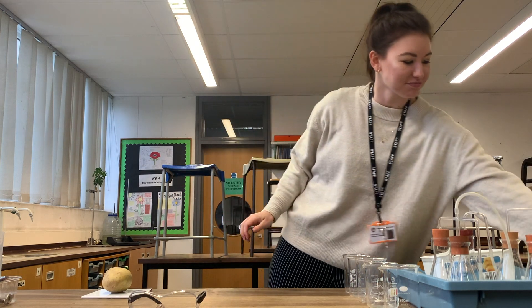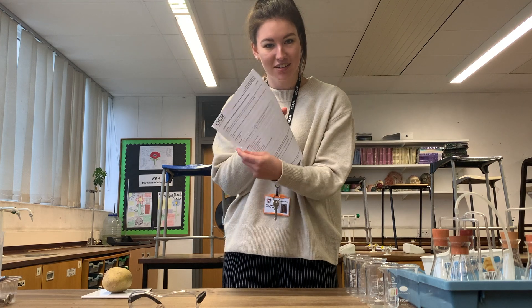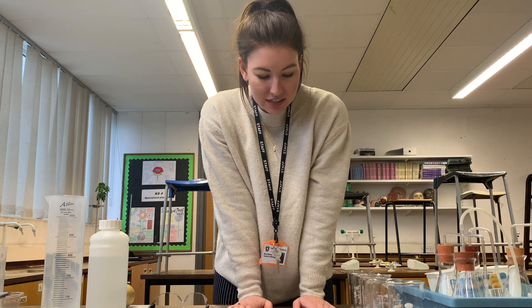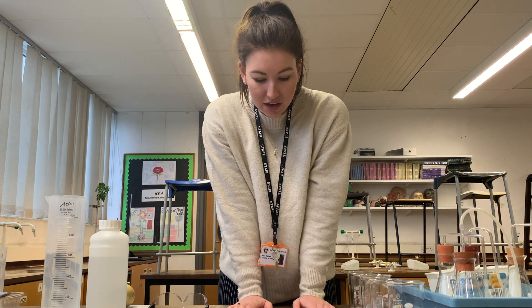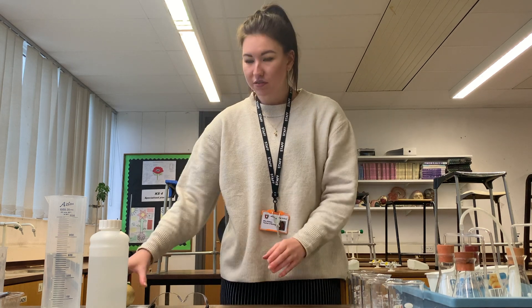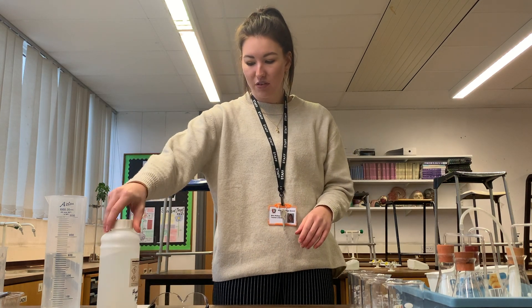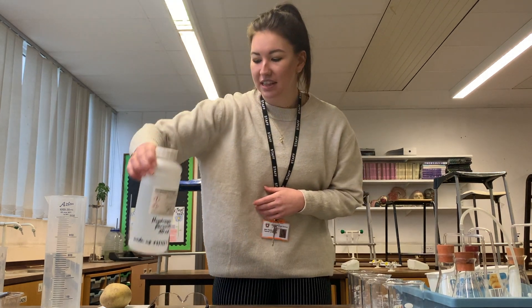This is PAG 4.1. I am recording myself doing it because you can't. I have the student worksheet that you would be following here. We are investigating the effect of changing the substrate concentration on the rate of hydrogen peroxide breakdown by catalase. Our source of catalase is this potato, and the substrate for catalase is hydrogen peroxide, which is in there.